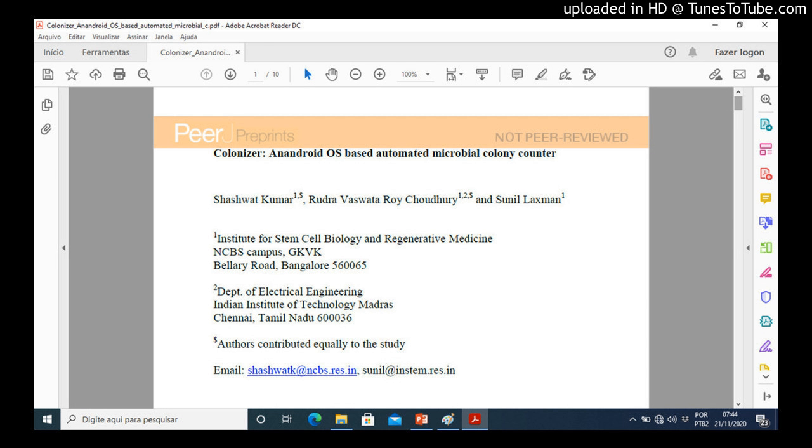We tested the app on 5 different smartphones running Android OS: Micromax Key 4014, Lenovo Vibe, HTC, Moto G, and Moto G4 Plus. The camera quality ranged from 5 to 16 megapixels.